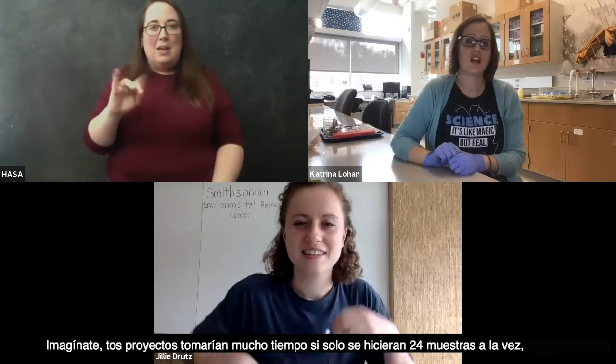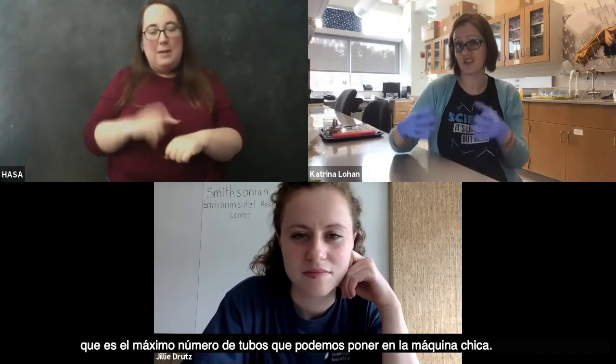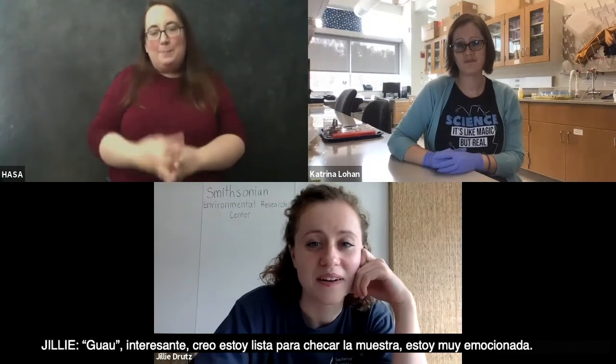So it could take a long time if you had to only do those 24 at a time, which is the maximum number you can put into the smaller machine. Wow. Okay, cool. All right.